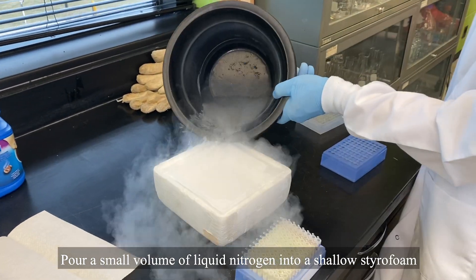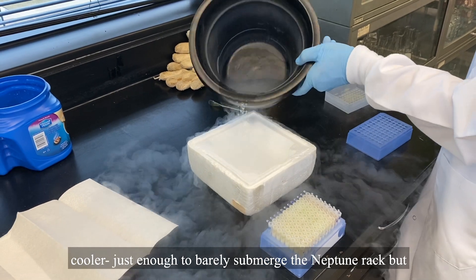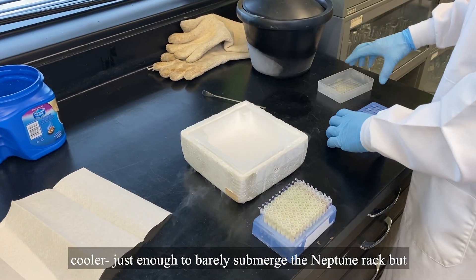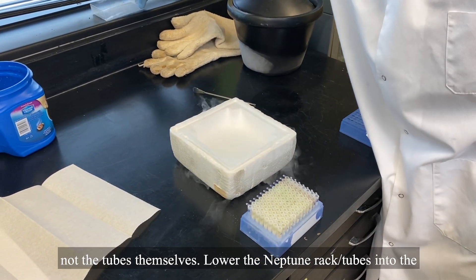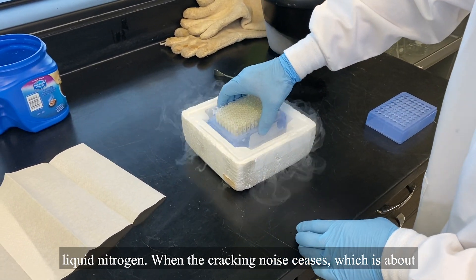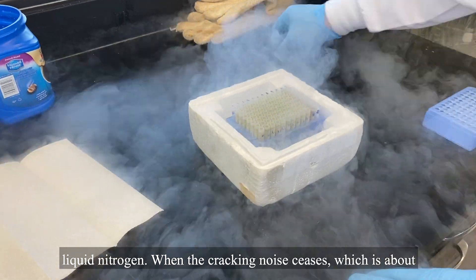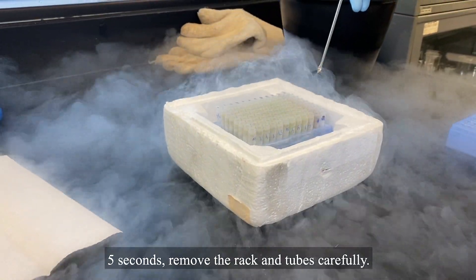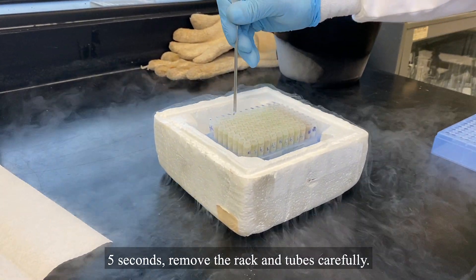Pour a small amount of liquid nitrogen into a shallow styrofoam cooler, just enough to barely submerge the Neptune rack but not the tubes themselves. Lower the Neptune rack tubes into the liquid nitrogen. When the cracking noise ceases, which is about 5 seconds, remove the rack and tubes carefully.